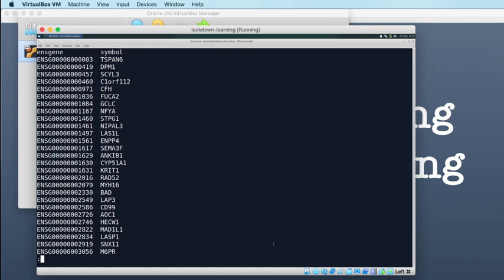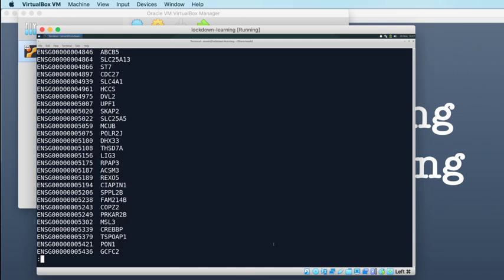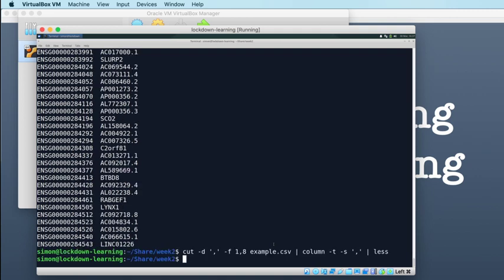We can also redirect the output. Instead of redirecting it to different programs, we can redirect it to a file. So I'm going to do this with the original CSV output. I'm going to press Q to quit less, and then go back up to my original cut command, and add a pipe on the end of this and pipe it to a file.